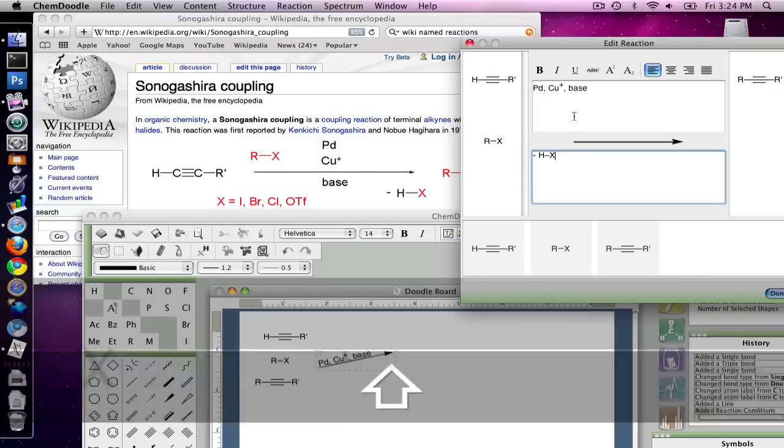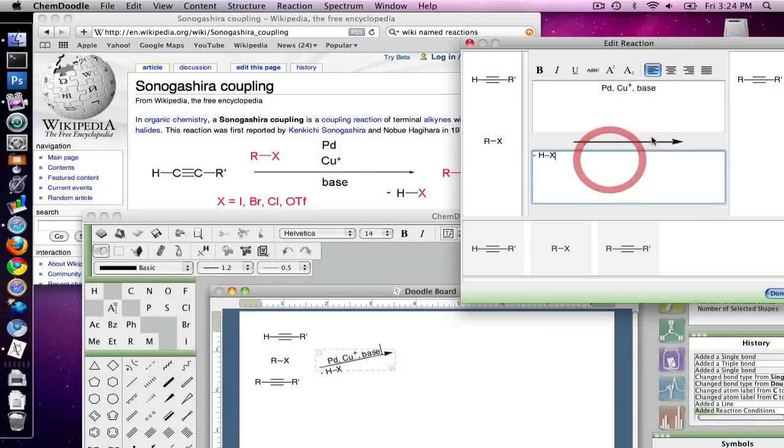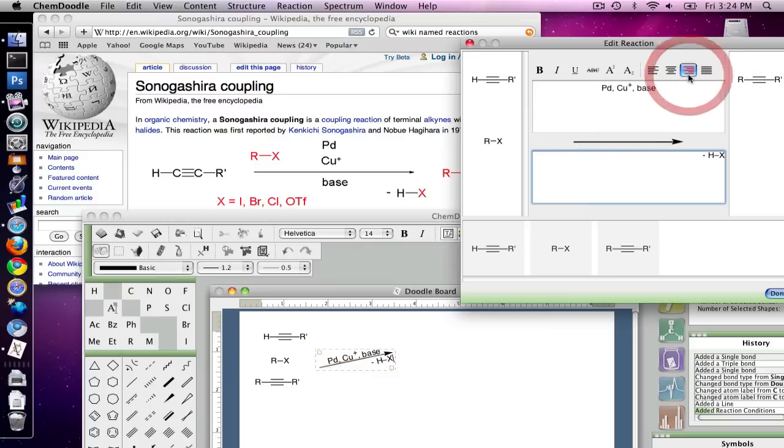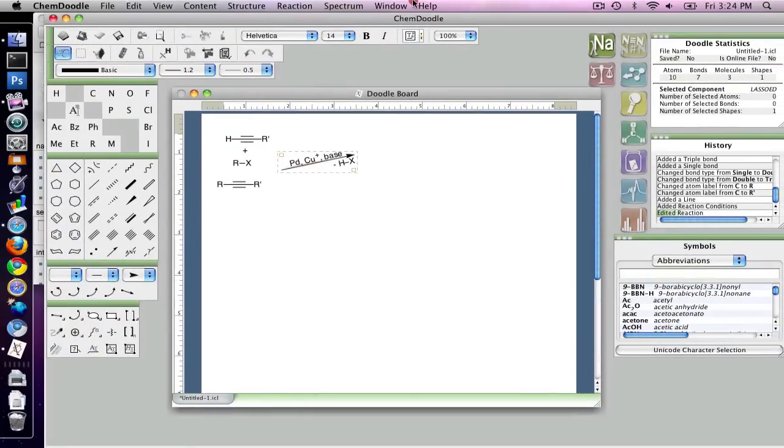So I want the top one to be centered, and I'm going to take the bottom one, I'm going to have that right aligned, and I'm going to click OK, and done. And the reaction has been set up.